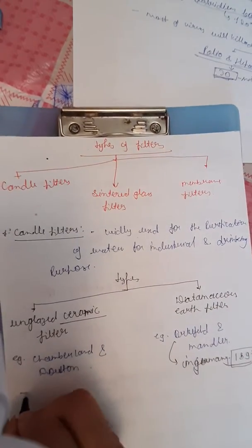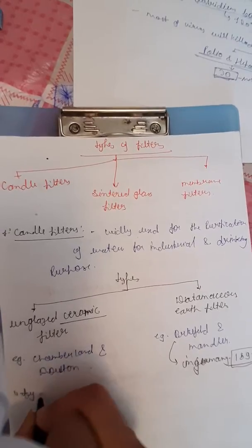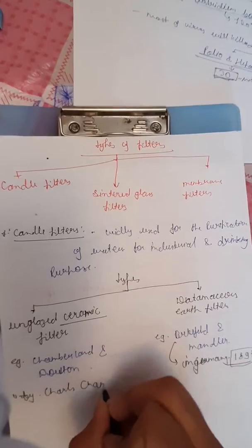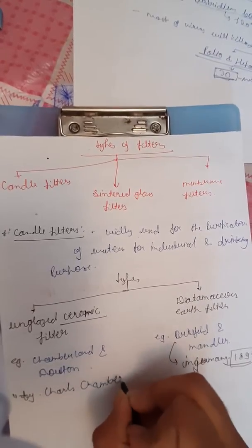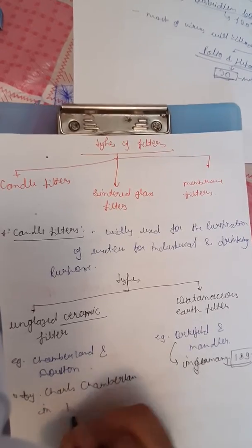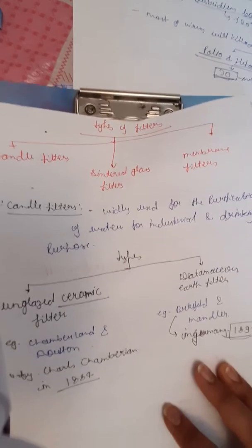It was discovered by a scientist, Charles Chamberland, in 1884. So that was all about the candle filters.